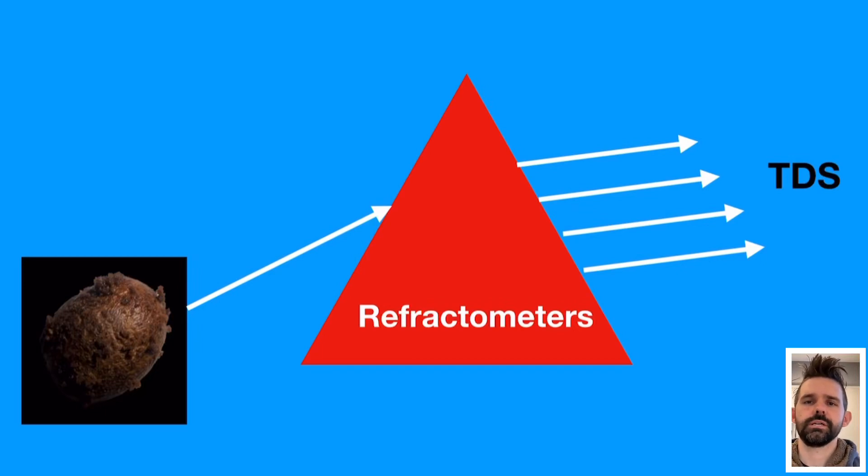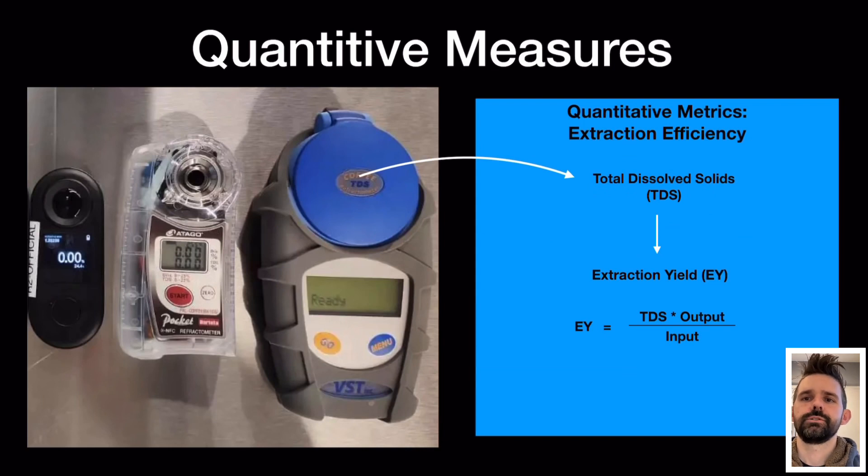We're going to discuss some refractometers today. Here is the R2, the Atago, and the VST.